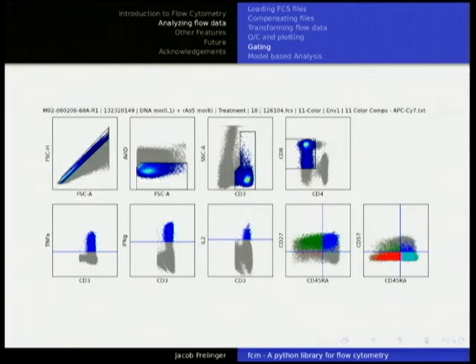So gating through, we grab, gates would then be named singlet gates. Those are viable CD3, then CD8, and then the bottom three on the left are all cytokine markers, which we're using as a proxy for activation. And then we plotted them to look at their maturational states. And therefore, this population down here would be one of our end target goal populations to find out how many cells there were. And so in a typical experiment, we'd look at multiple of these and try and decide if treatment had more activated T cells or had more memory T cells than case and control.